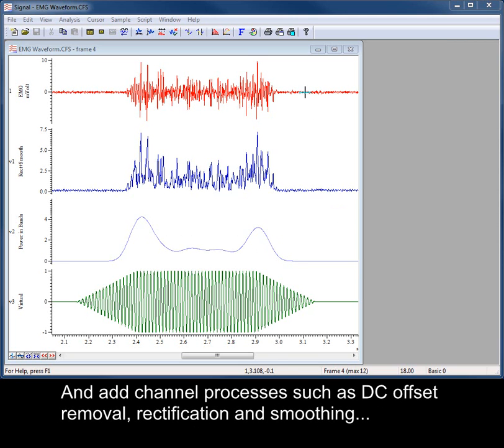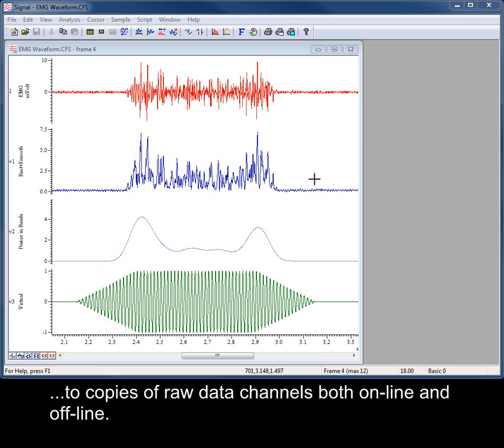And add channel processes such as DC offset removal, rectification and smoothing to copies of raw data channels both online and offline.